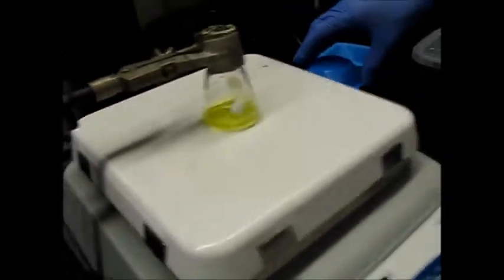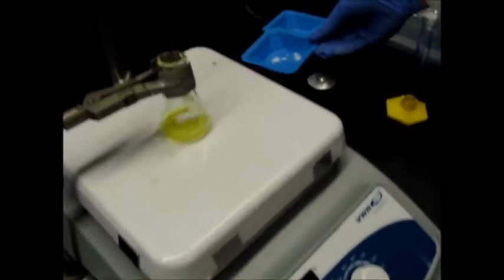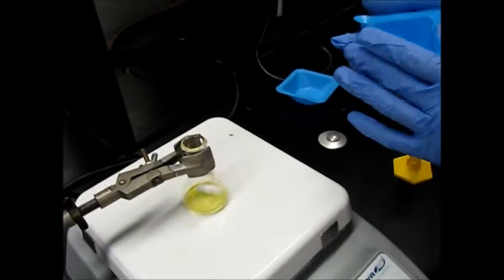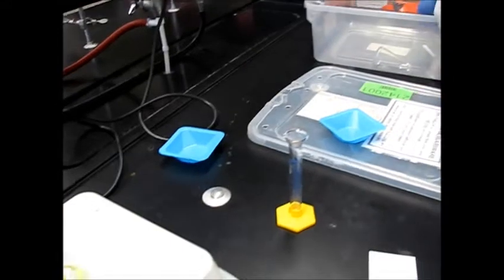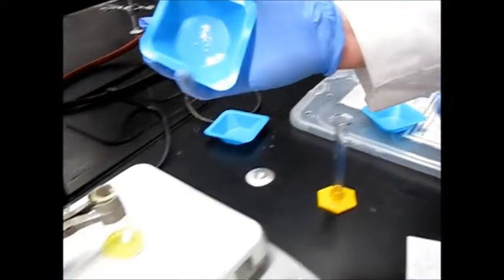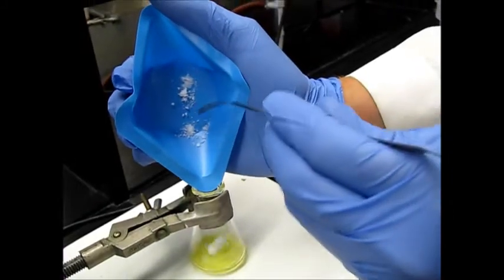Next we're going to add our 50 milligrams of sodium borohydride. Like I said, this stuff is kind of sticky. So I'm going to go ahead and try to scrape out anything that doesn't just come out with this spatula here.